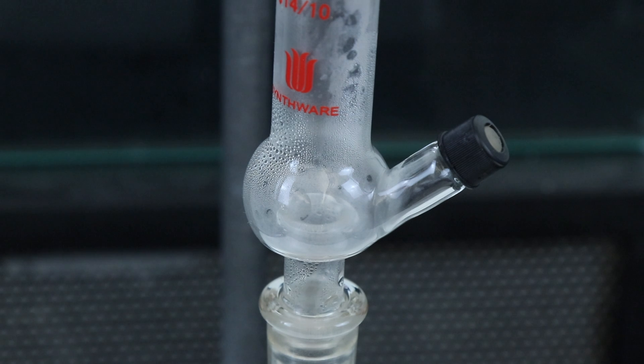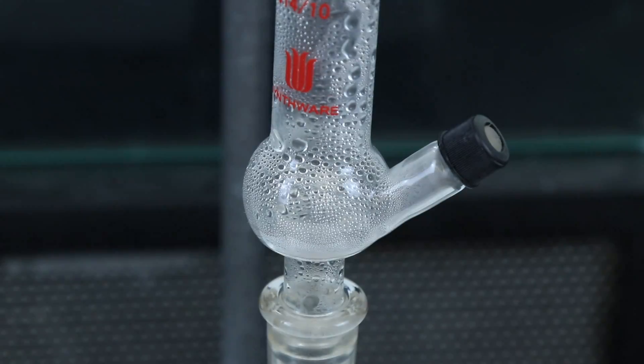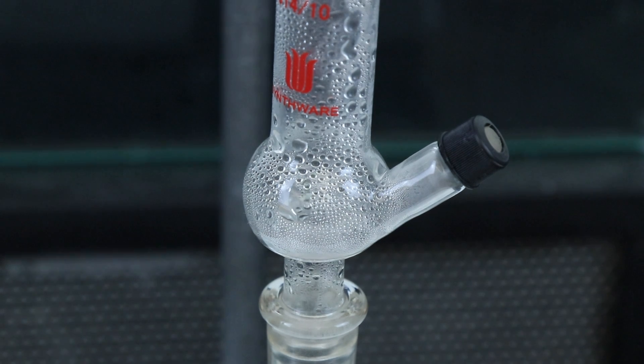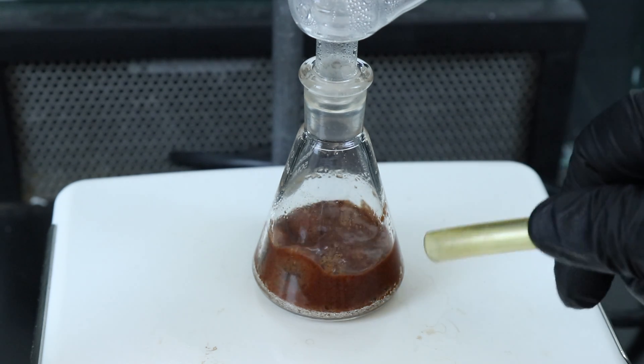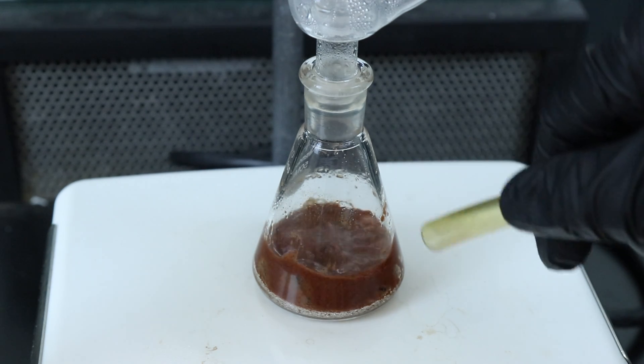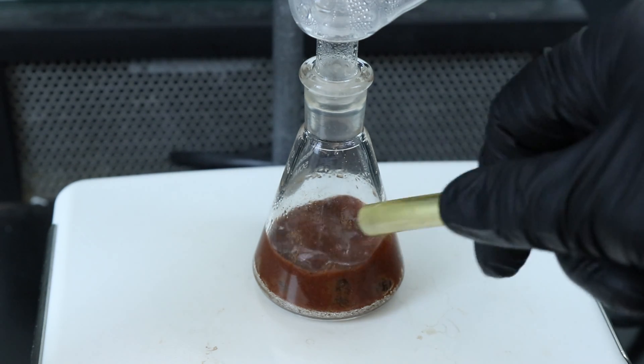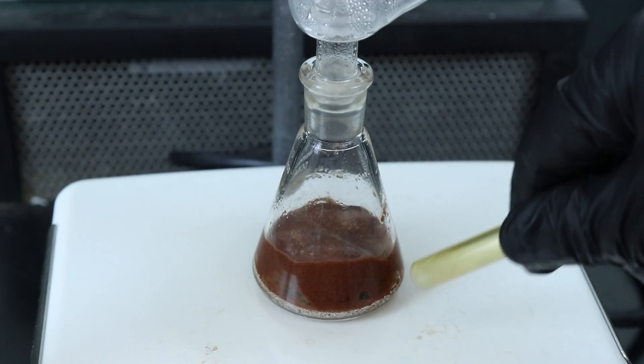Eventually the distillate will start to condense in the Hickman still and when the base fills up we can begin gathering it using a Pasteur pipette. Be careful to monitor the cinnamon because we don't want it boiling up into the Hickman still, so if it starts getting close a lot of air can be used to cool the flask down. Right now it's actually not an issue but I just wanted to show what to do if it did start boiling too violently.